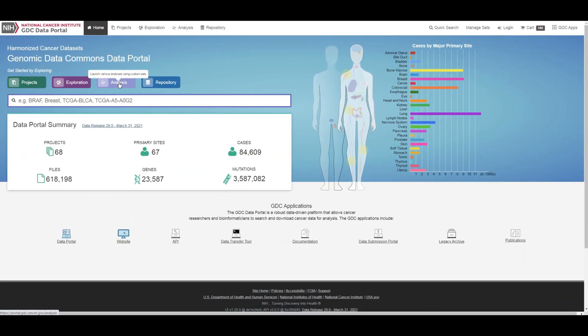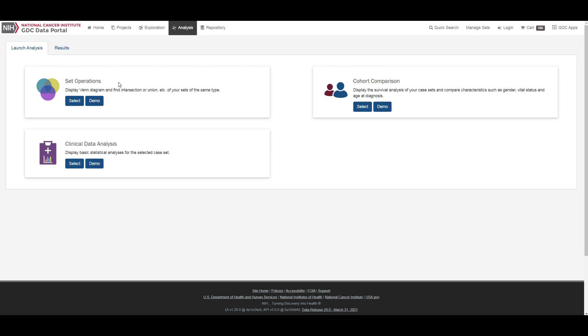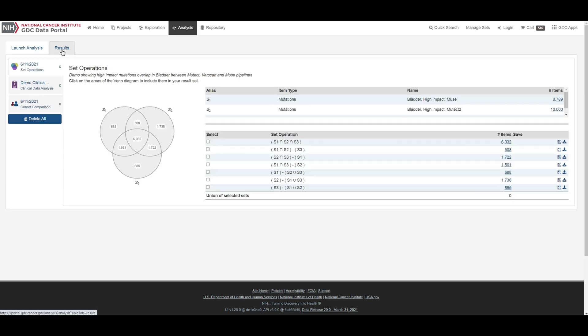In addition to the exploration page, the GDC data portal also has features used to save and compare sets of cases, genes, and mutations. These sets can either be generated with existing filters or through custom selection. There are three tabs on this page. Users can select either to do set operations, cohort comparison, or clinical data analysis. The results tab is where users can view the results of current or previous set analyses.